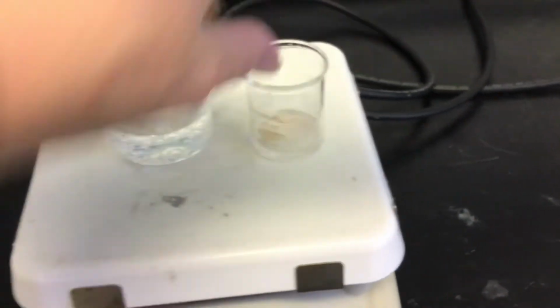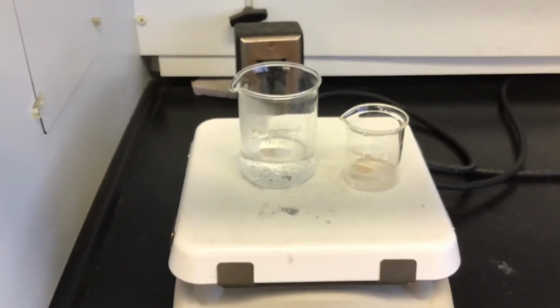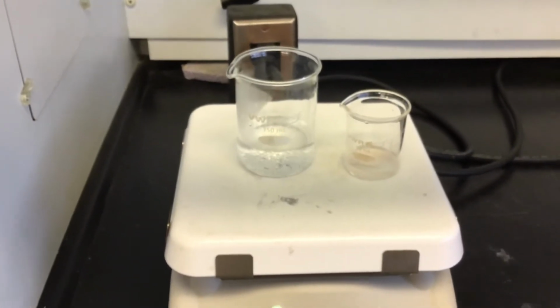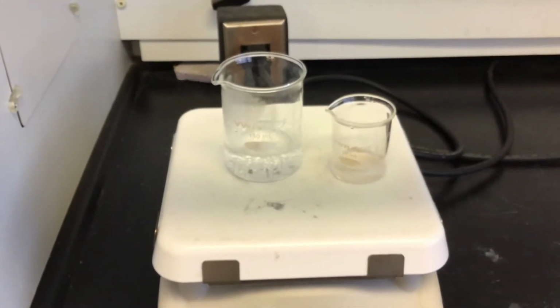Alright, so what I'm going to do is I'm going to come over to the same hot plate over here, okay, and I'm going to stick the sand beaker now on that hot plate. And I'm going to wait for that water to evaporate. So I just have sand, and then the beaker on the left, when it evaporates, I'm just going to have salt. When that gets done, I will be back.